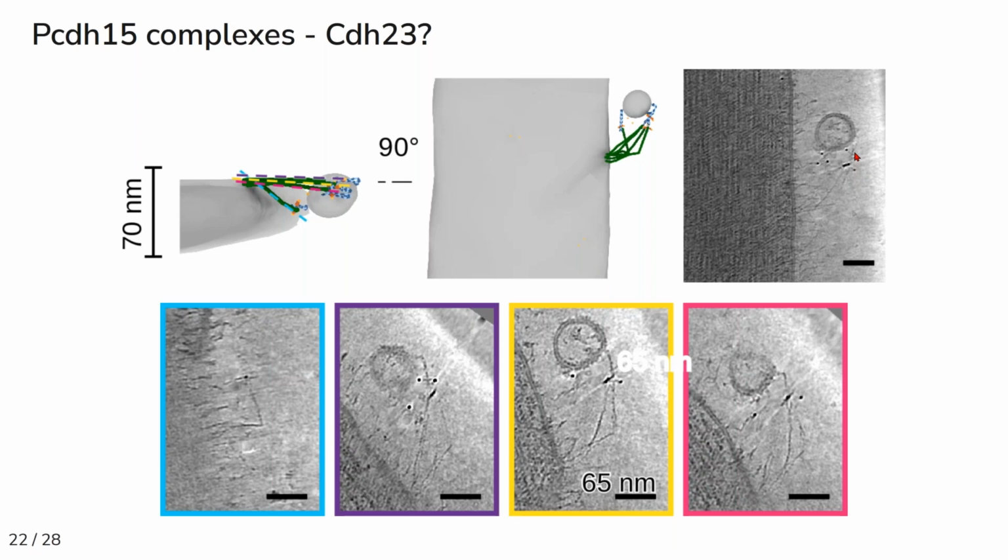And in these images, what was quite striking is that we see strong bends, both in cadherin-23 here and here, but also on the protocadherin-15 side, there seems to be a very striking 90-degree bend that precisely matches up with that joint between cadherin repeats 9 and 10 that we saw in the single particle data.